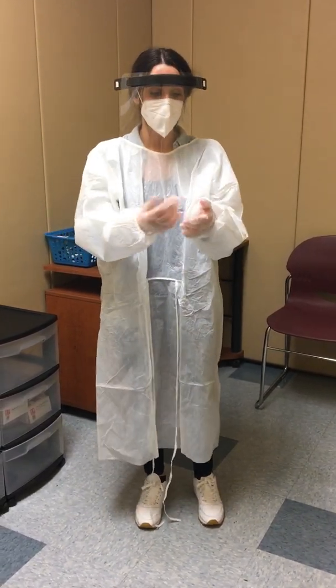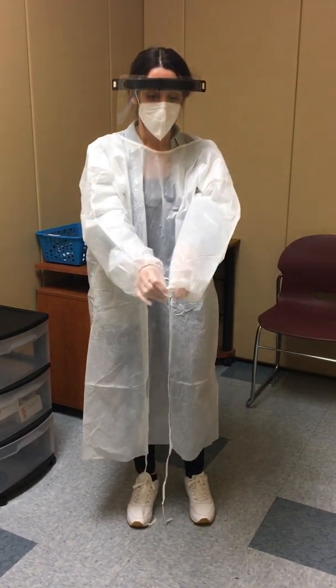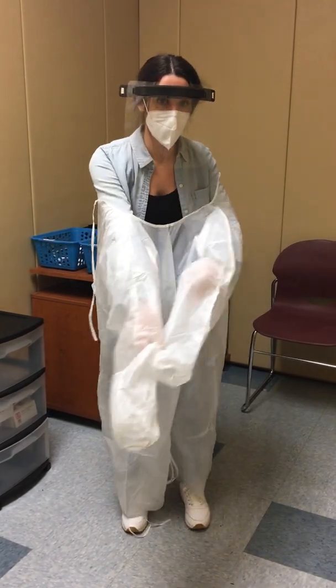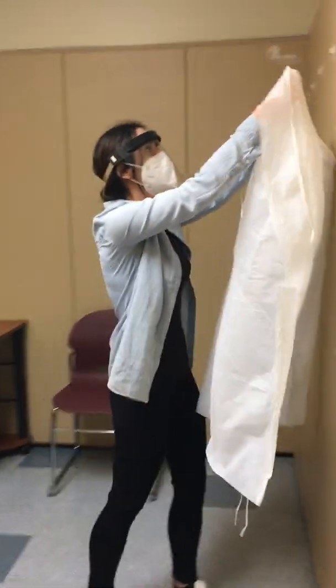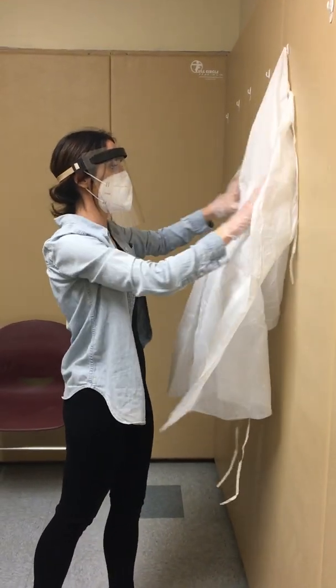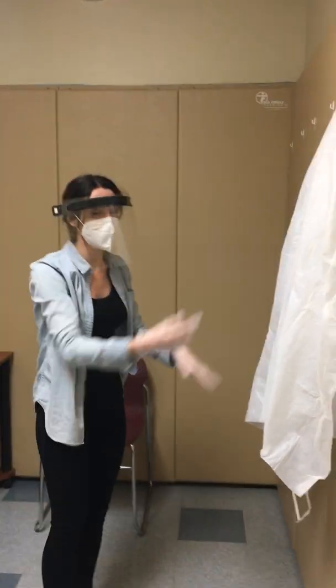But in this case where I am going to reuse my gown, now that I have those untied and I put these gloves on, I would take the edges of the sleeves, pull them down, and then pull it off this way so that I'm only touching the inside. And then I would hang it just how it was when I had first come in, with the outside against the wall, and again I'm only touching the inside.